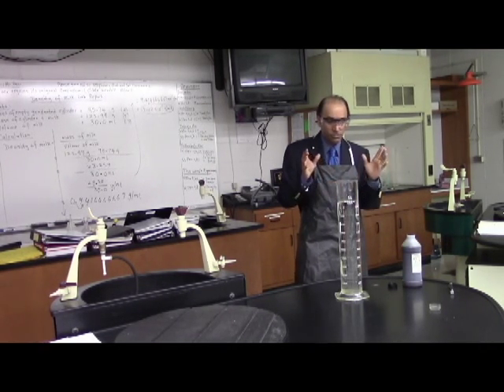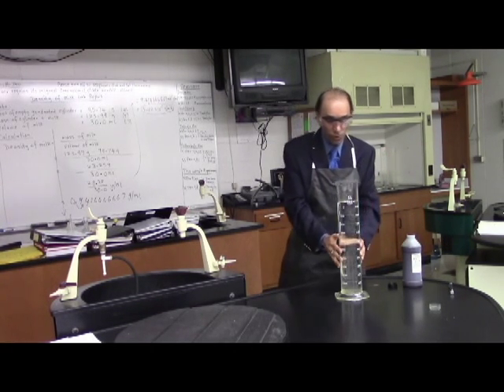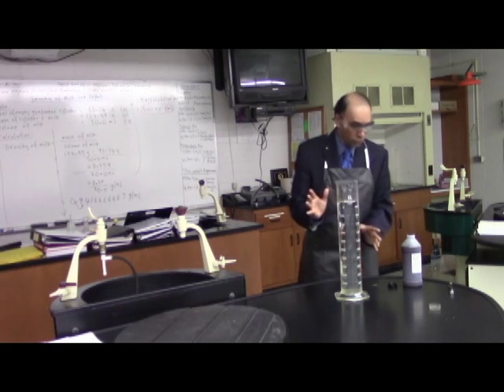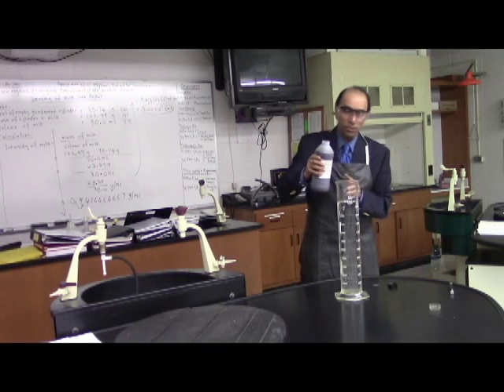It's in the form of a solution and I'll be pouring it into water. This is tap water and it's in a graduated cylinder. So it's a tall graduated cylinder and here I go. Very simple experiment.